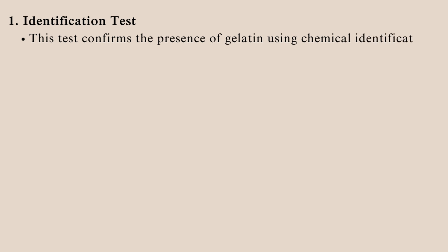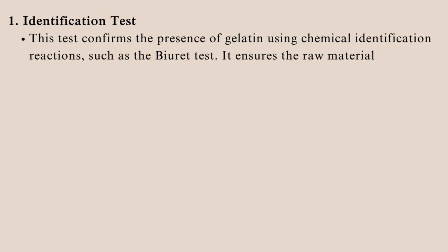Identification test. This test confirms the presence of gelatin using chemical identification reactions, such as the Biuret test. It ensures the raw material is genuine and pharmacopeia compliant.